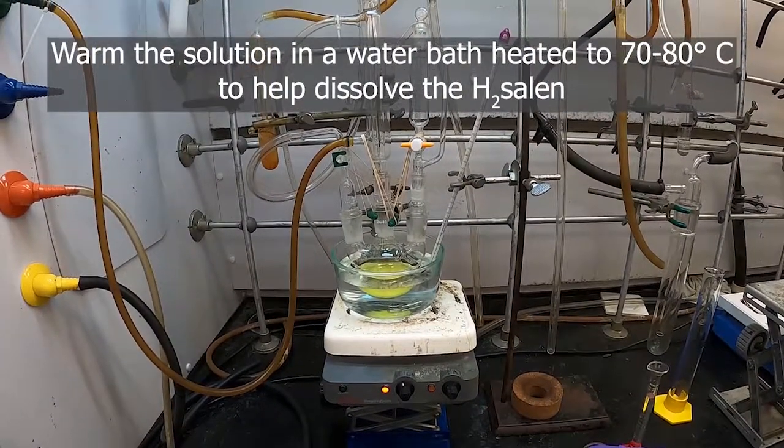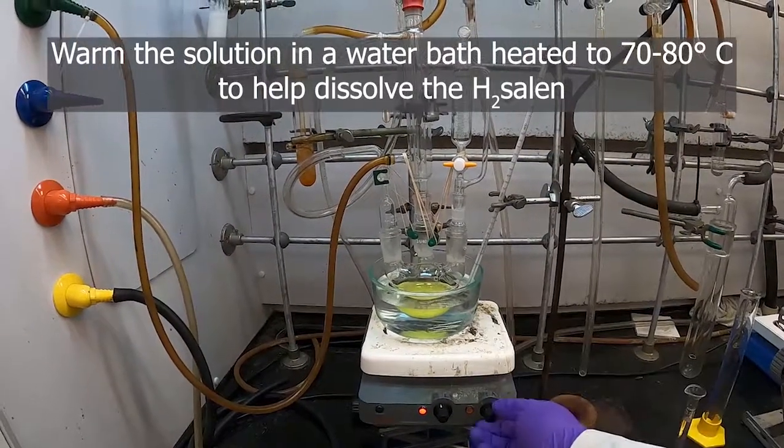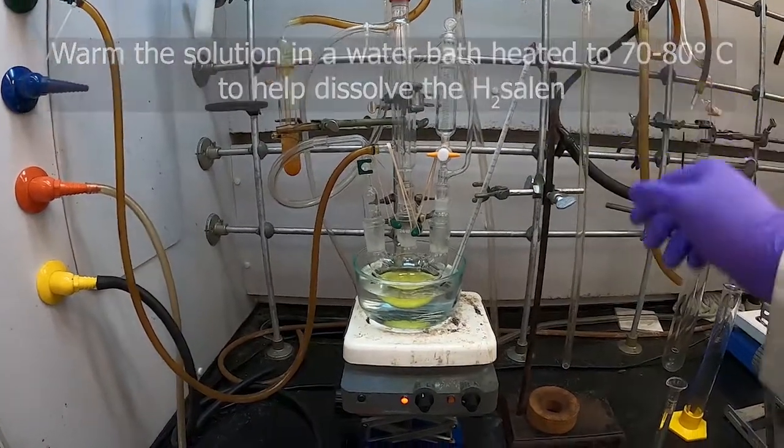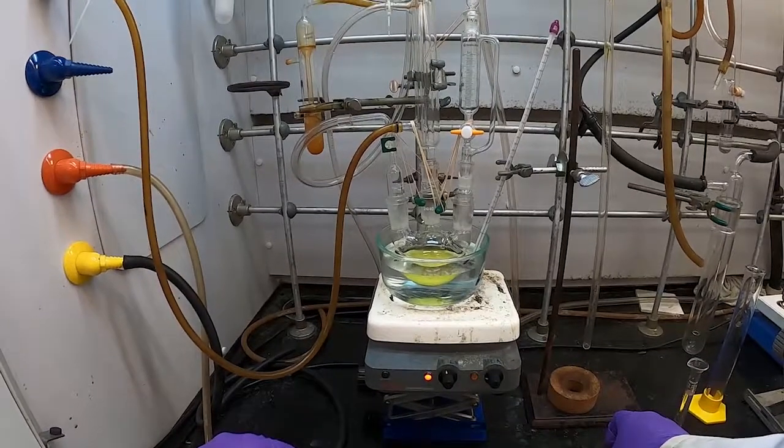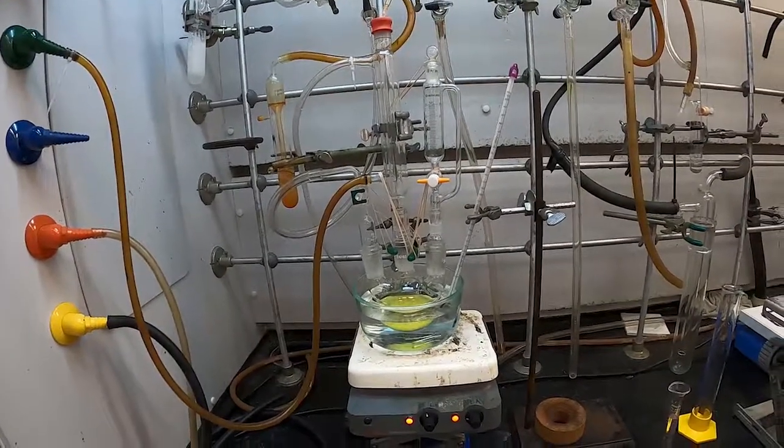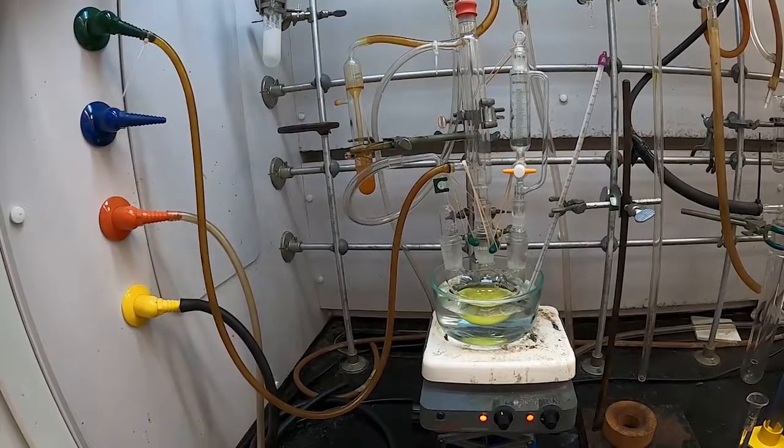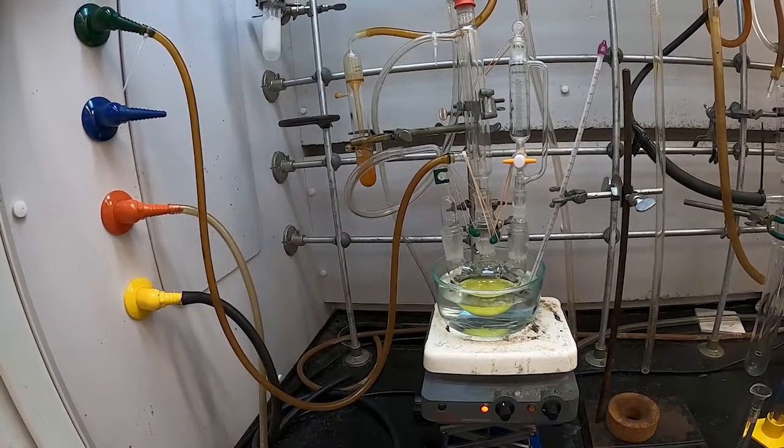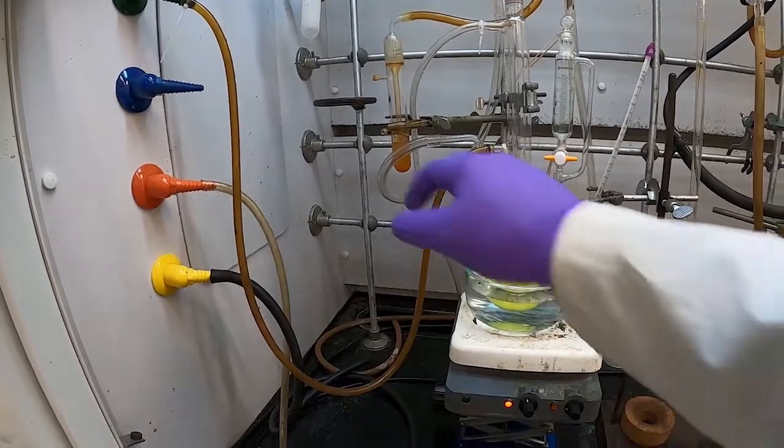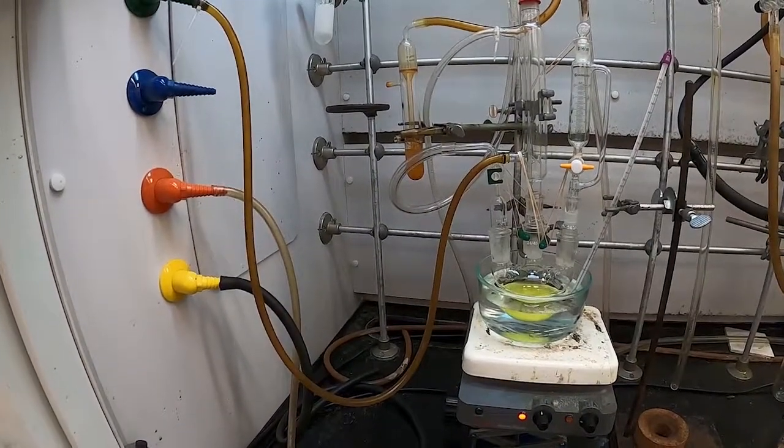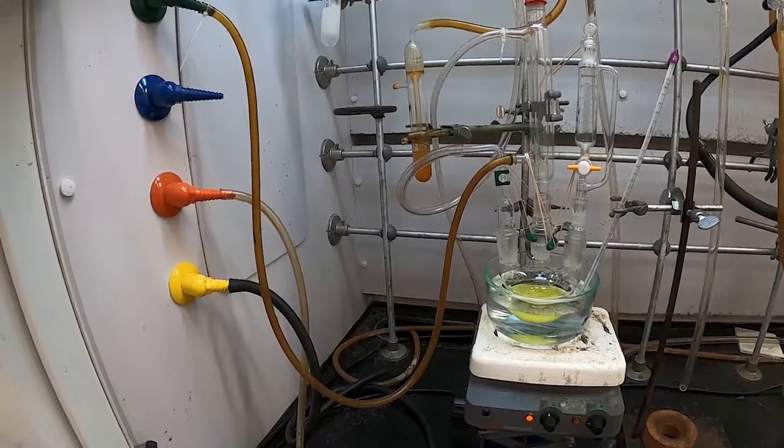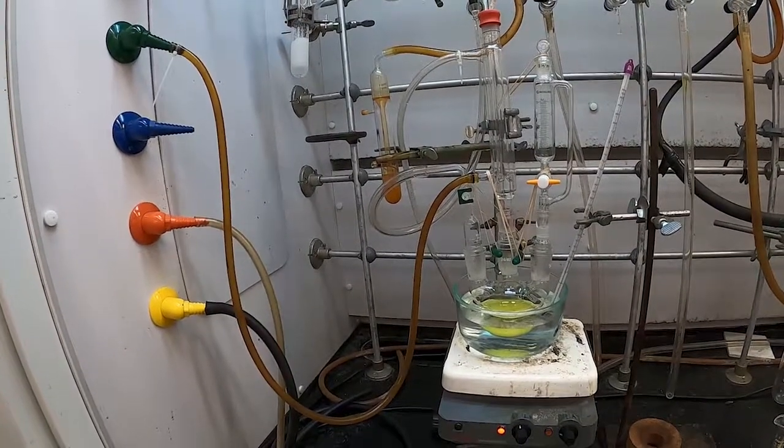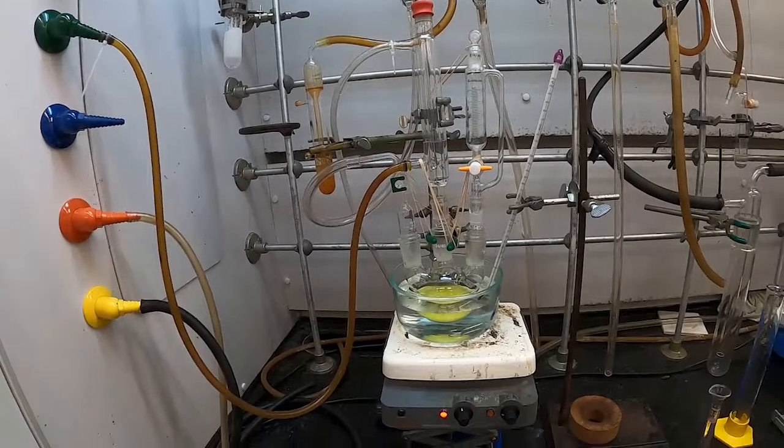In order to get the saline to dissolve in the ethanol, we need to heat our solution here, hence the water bath. So we'll heat this. We want it to be between 70 and 80 degrees. So while that's heating, we can slow our nitrogen flow considerably, maybe one bubble per second or so. And we can also fill our condenser with water from the water tap here.